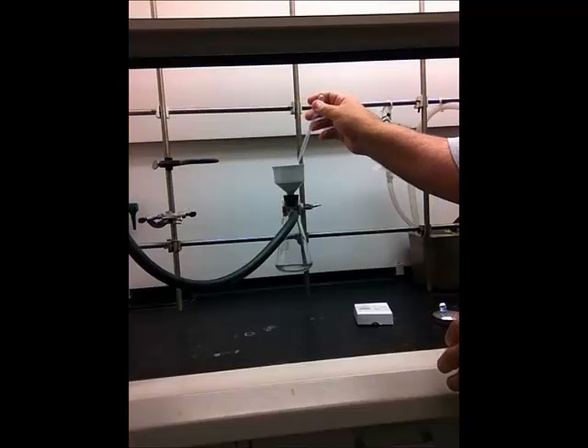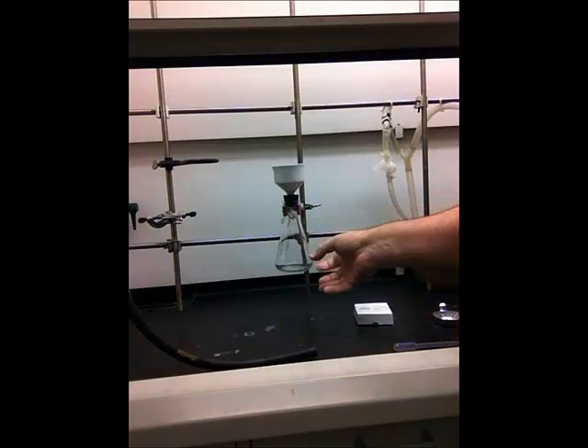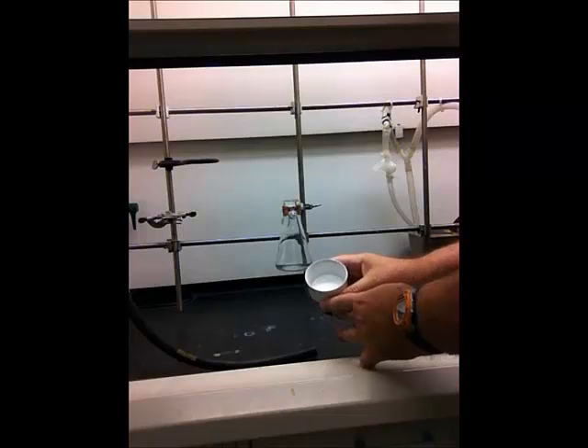If you need to wash the crystals with solvent, do that with a pipette — the vacuum is typically on while you do this. When done, air dry the crystals by letting air pass through via the vacuum for a few minutes to help dry them. When you're finished, first pull the vacuum tube off the filter flask, then turn the vacuum off. If you just shut the valve without removing the tube, solvent can shoot up into the vacuum system.